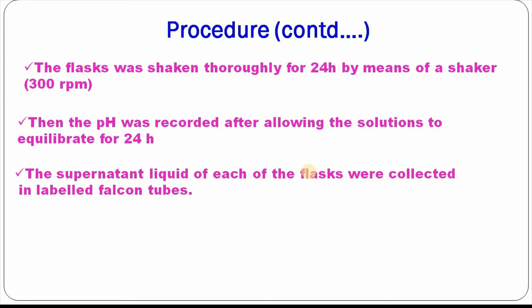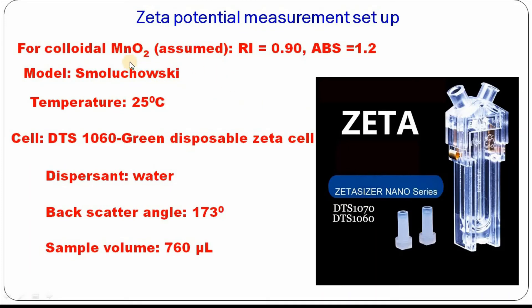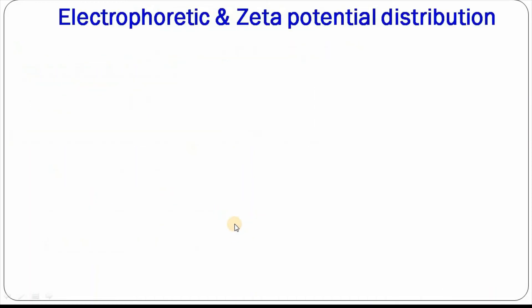The supernatant liquid of each flask was collected into labeled Falcon tubes. Zeta potential was measured at 25°C using 760 microlitre of supernatant loaded into the sample cuvette, and corresponding data was recorded. For manganese dioxide, the refractive index, absorbance, and model parameters were set accordingly, temperature was 25°C, a green disposable zeta cell was used, dispersant was water, backscatter angle was 173°, and sample volume was 760 microlitre.